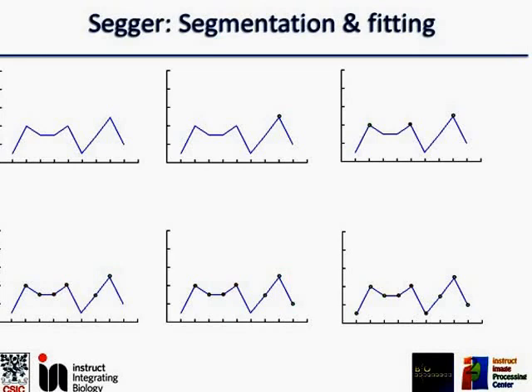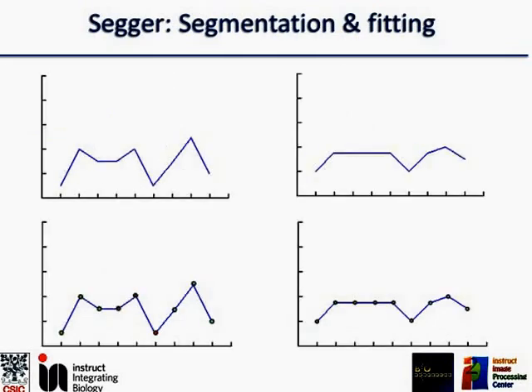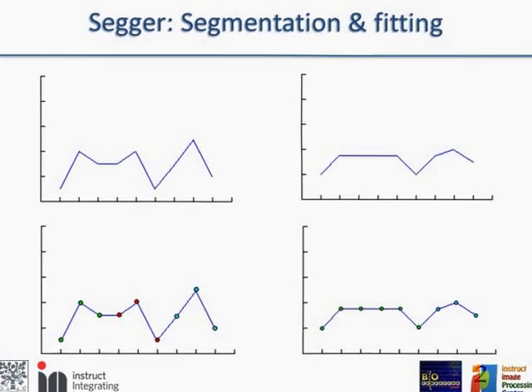So what Segger is doing is merging them. And how are they merged? Segger smooths our signal, our density function, and applies the same process to the smoothed signal, and I will obtain something like this.